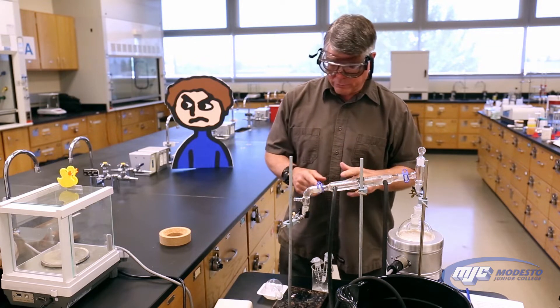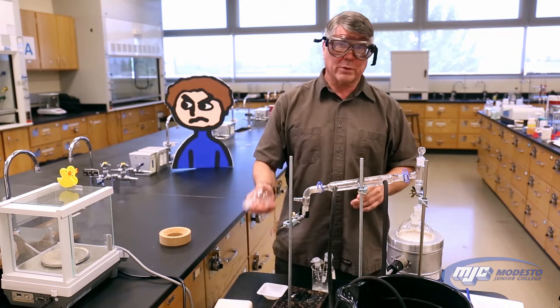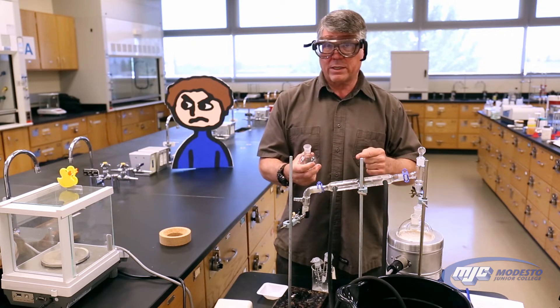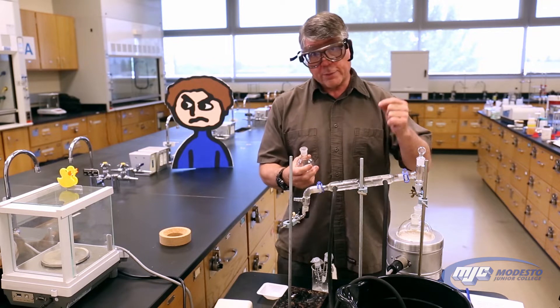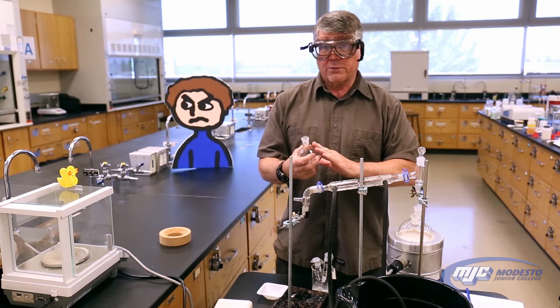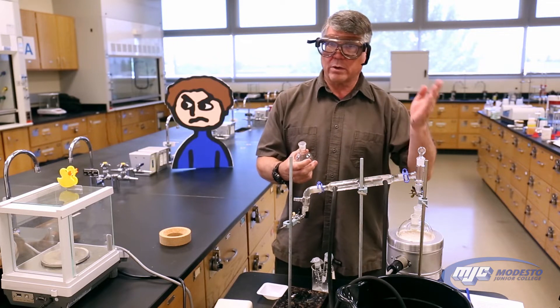Another thing we're going to look at is how pure this water is. The way we're going to do that is we're going to measure its density and compare that to the known density of pure water. Now the thing is, density depends upon temperature, so we're going to have to measure the temperature of this water and then look up the density of water at that temperature.